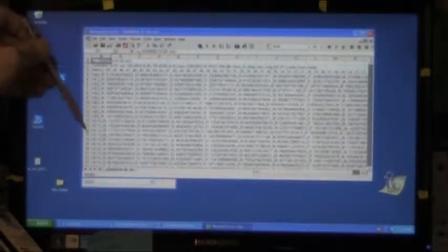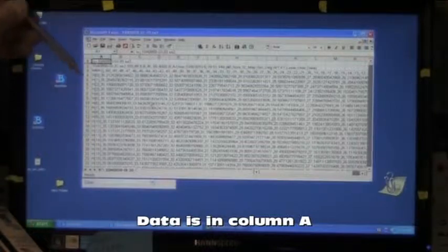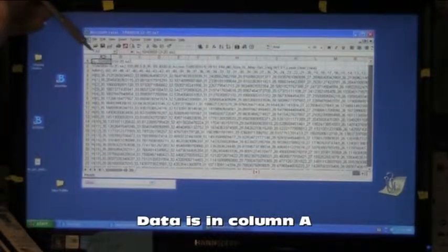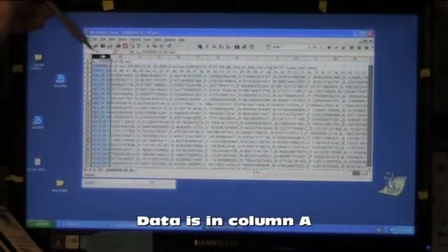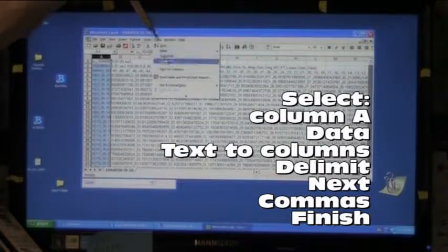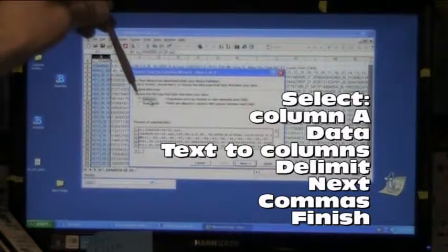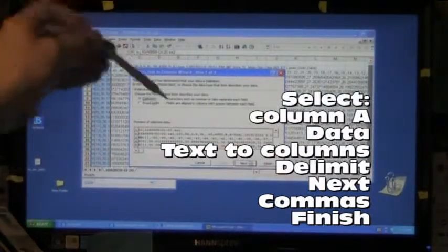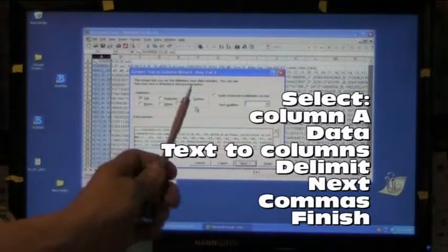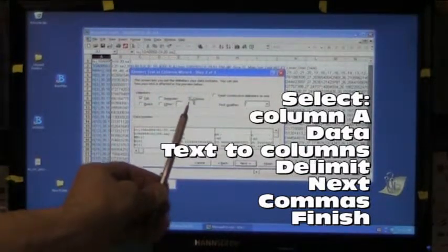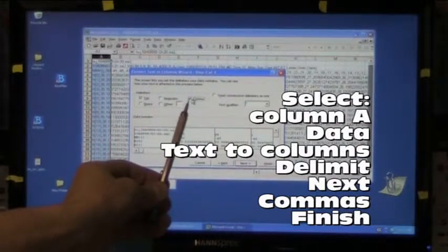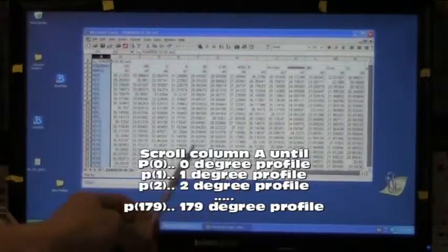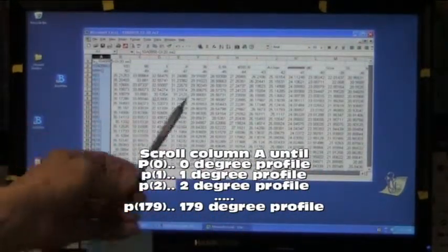Once Excel is open, all of the lines of data are input into column A. Select column A, select data, text to columns, delimited is already selected, select next, select the comma box, then finish. This puts all the data in the columns separated by the commas.